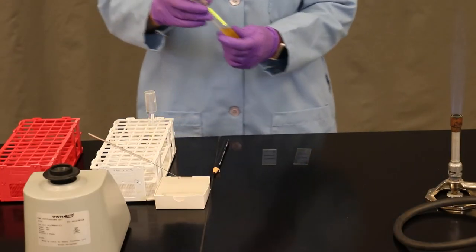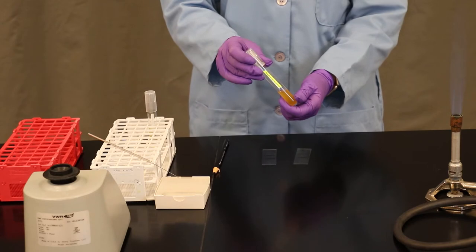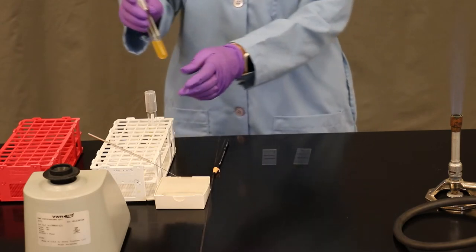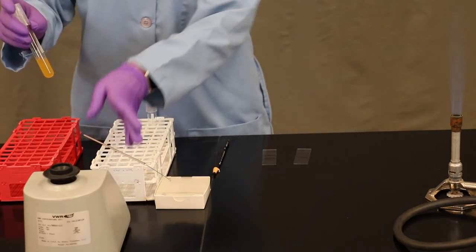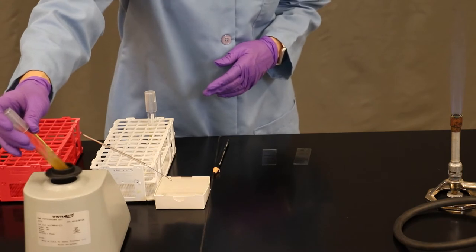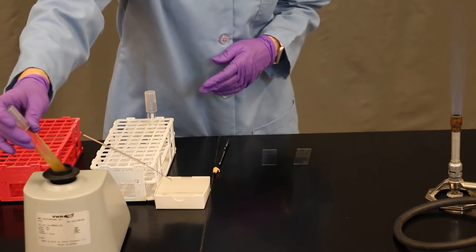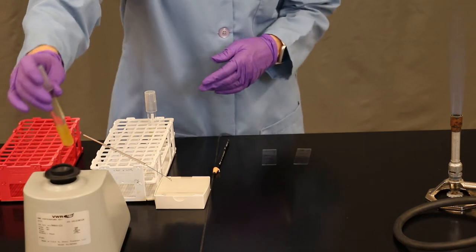We're going to start with a broth culture of Staphylococcus aureus, and the first thing you should always do with your broth is make sure to vortex it in order to mix it. We're holding the cap down, angling the tube on the vortexer and mixing for about five seconds.